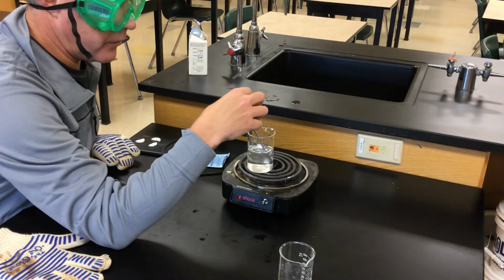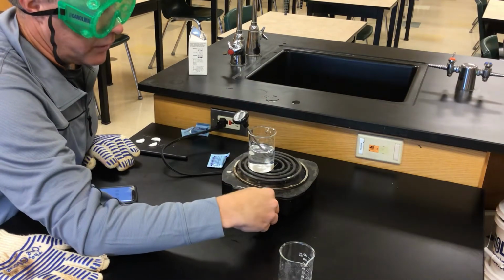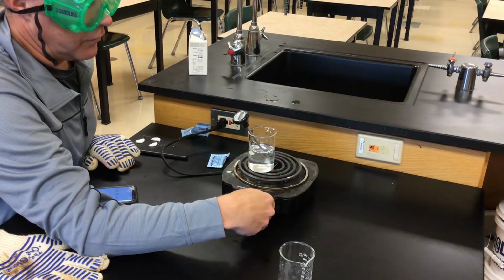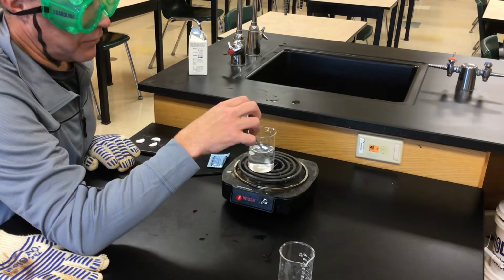We need to get to 36 degrees Celsius again. Looks like we got a little ways to go. So crank up the heat on it a minute. Doesn't take very long to get to 36 with this little water. See it ticking up pretty fast.